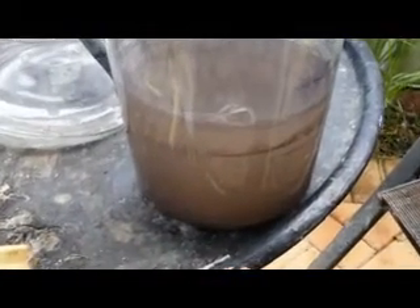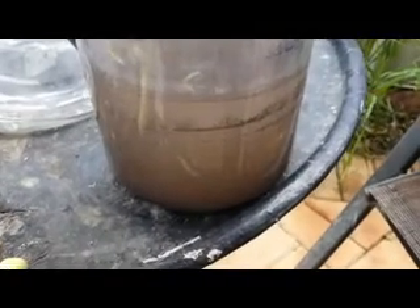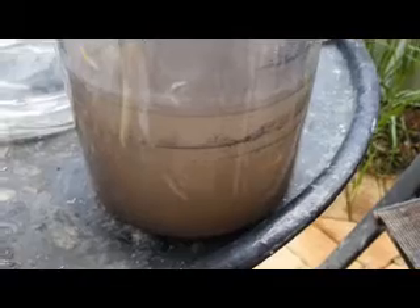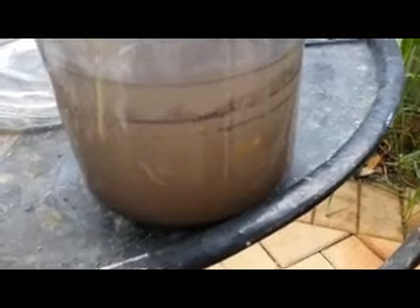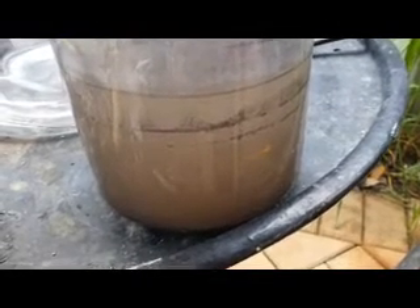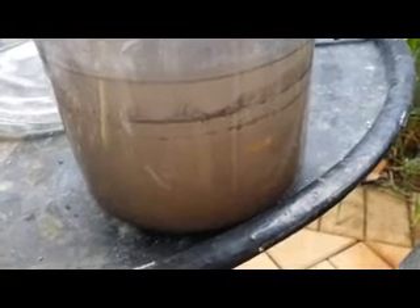G'day viewers, today I'm going to show you a way of cleaning up silver powder. Even the eBay refiner doesn't do this, and he classes himself as some kind of silver specialist. This is a really good way — it makes it all clump together nicely instead of being a fine powder, and it removes any contaminants that are in the powder that just rinsing alone doesn't remove.